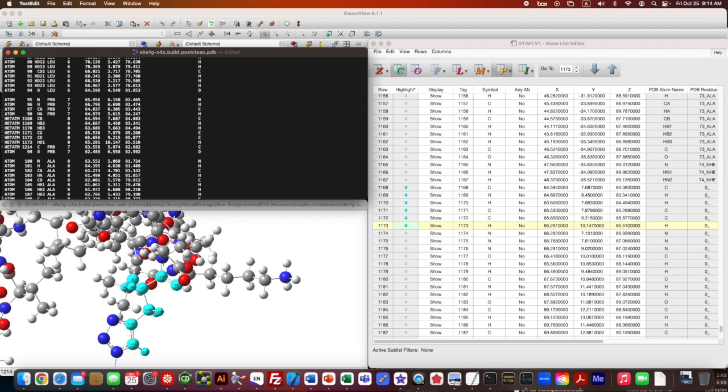With PDB files, you want to make sure everything's aligned with everything else. That's how it knows what the columns are. I don't totally know the number of spaces. You just keep it consistent. You've got some wiggle room in the atom names if you need more space, but the residue names all have to be here. And then I'm just going to make sure that the residue name and number is correct there.